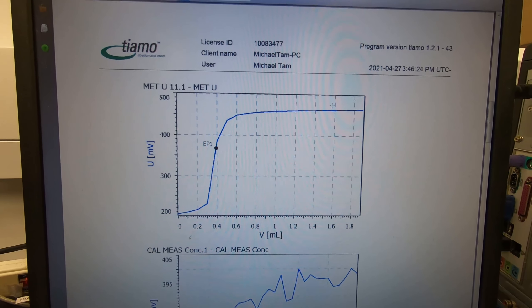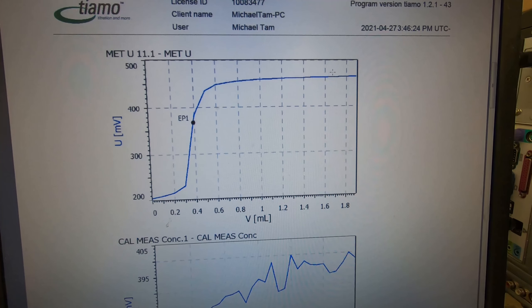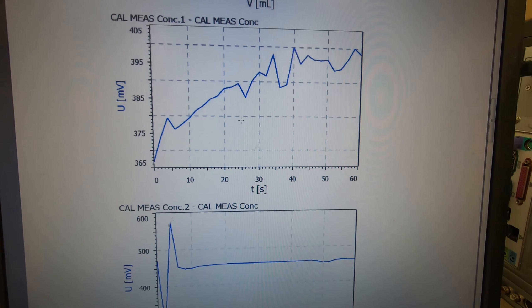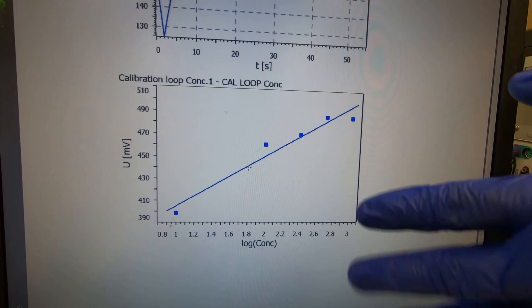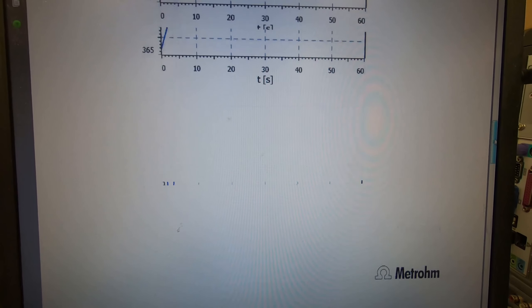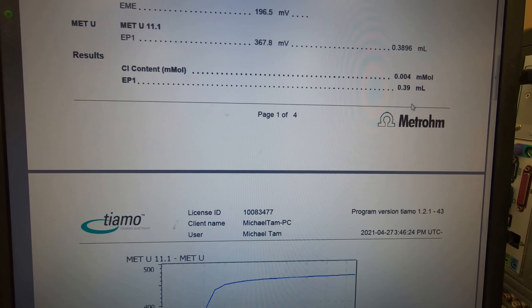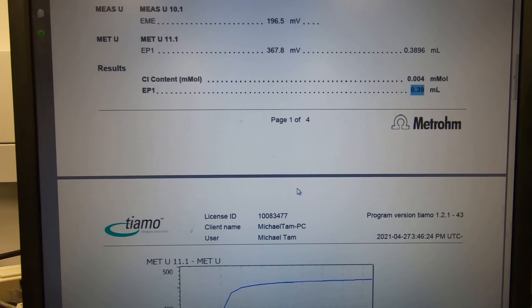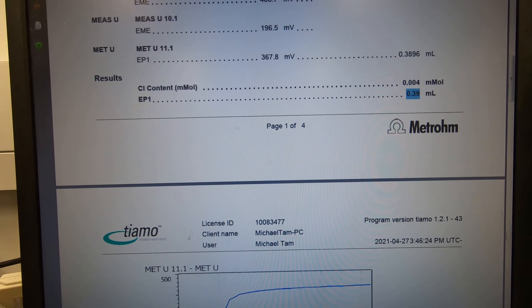The curve is automatically generated. After it reaches the end point it will run another 1 ml and then stop automatically. These are the calibration data - first, second, third - they don't matter. Only the end point matters. The result is set up so we don't need to calculate separately. This shows how much silver nitrate is consumed.